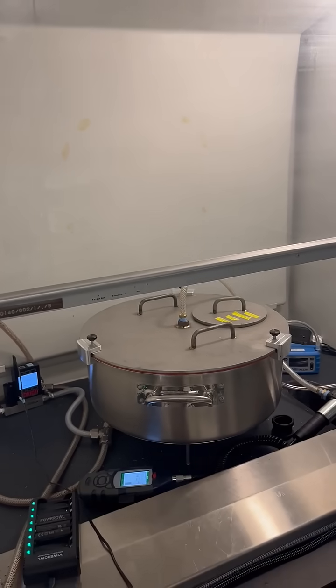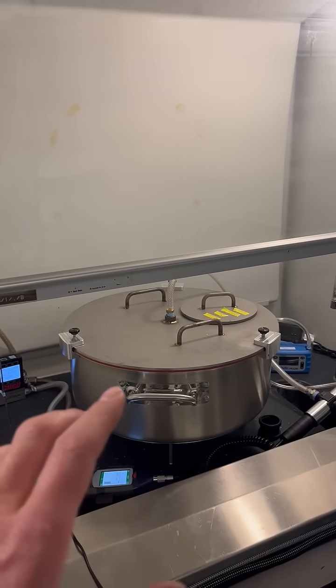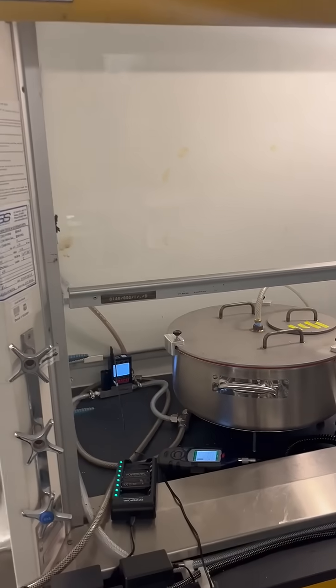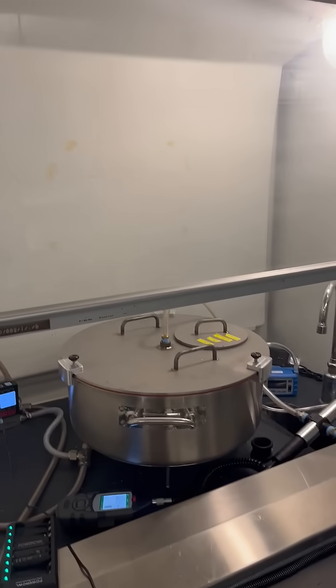Inside the hood we have a mouse exposure chamber. The mice are getting smoke that has been diluted three different times here, here, and back there to hit a specific concentration that is our target.